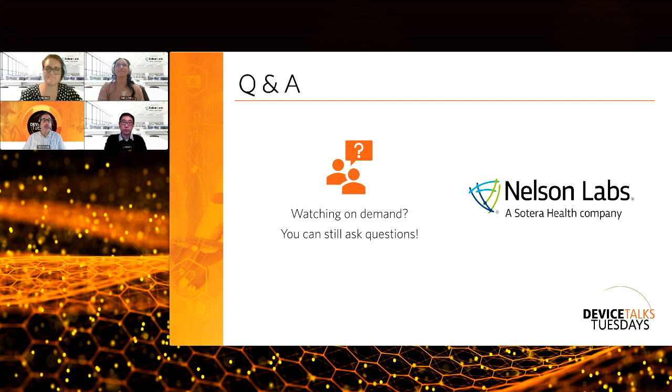All right. Last question is from Malvika. Is there a maximum for surface area of device? You went over the surface area to volume ratio of extraction media, which makes sense, but what about the surface area of device as a whole?